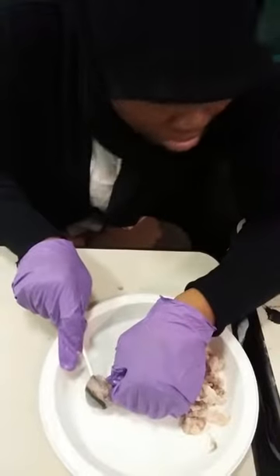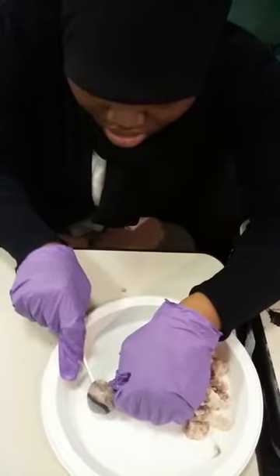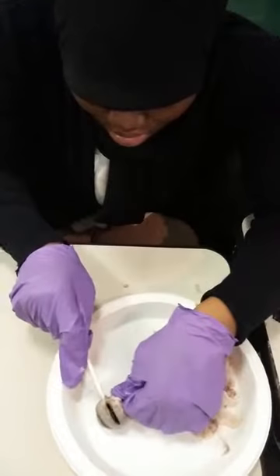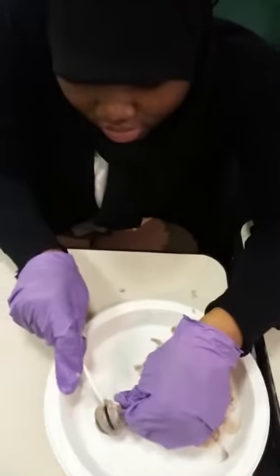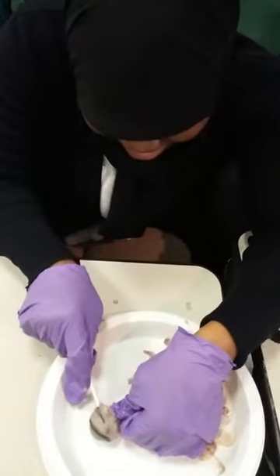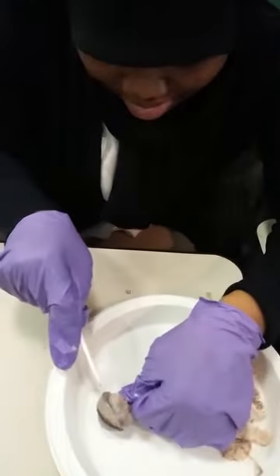This membrane, that's the retina. This is so hard, this little curly thing. Okay. And then you take the scalpel. You got it? This is Naminata opening her eye, cutting it in half. Scrape it. We're going to look at all those anatomical structures.